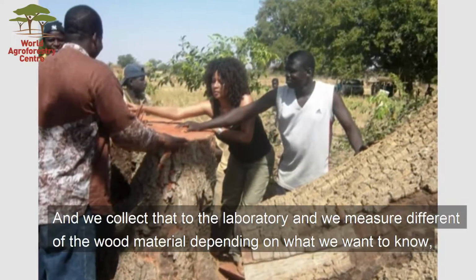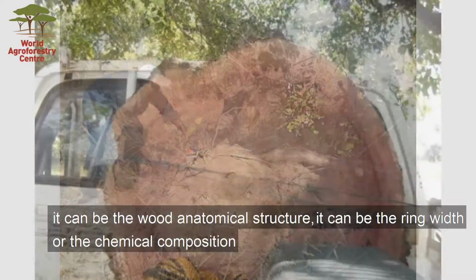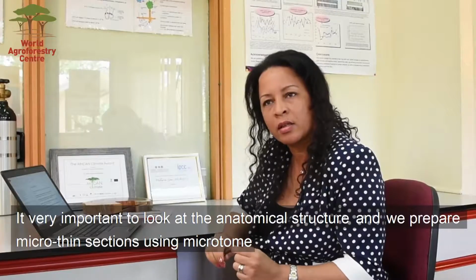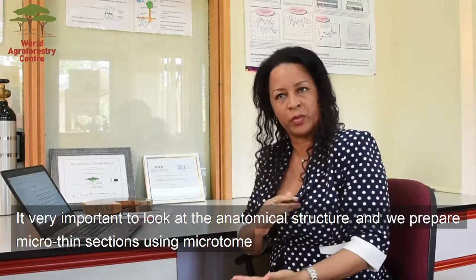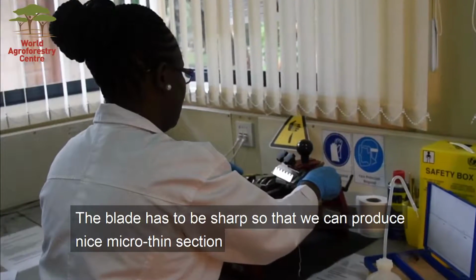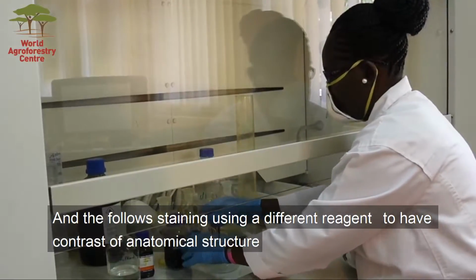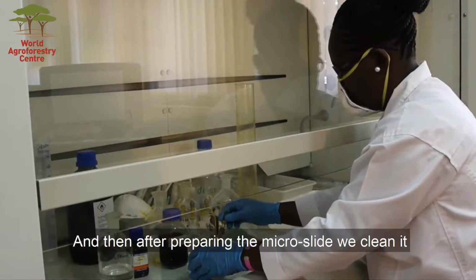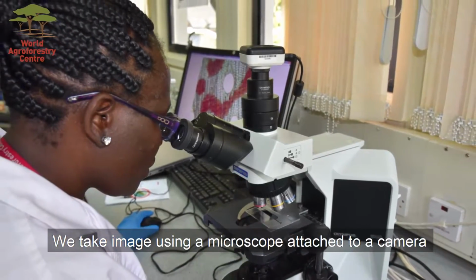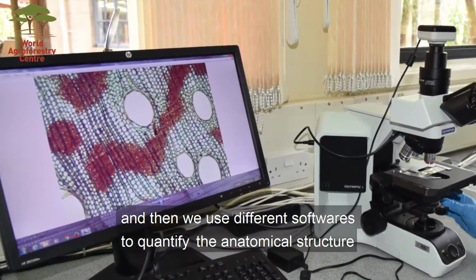We bring that to the laboratory and we measure different parts of the wood material depending on what we want to know. It can be the wood anatomical structure, the ring widths, or the chemical composition. It's very important to look at the anatomical structure, and we prepare microsections using a microtome. The blade has to be sharp to produce a nice microsection, and then follows staining with different agents to have contrast of the anatomical structure. After preparing the microslide, we clean it, and then we take images using a microscope attached to a camera, and we use different software to quantify the anatomical structure.